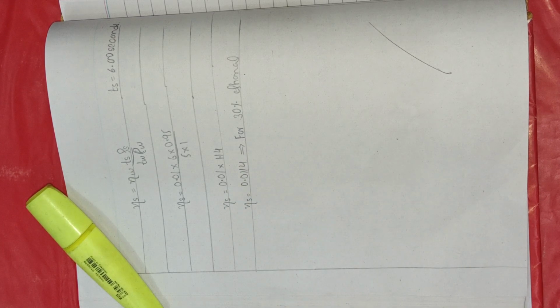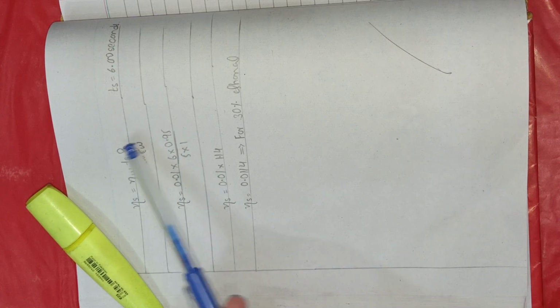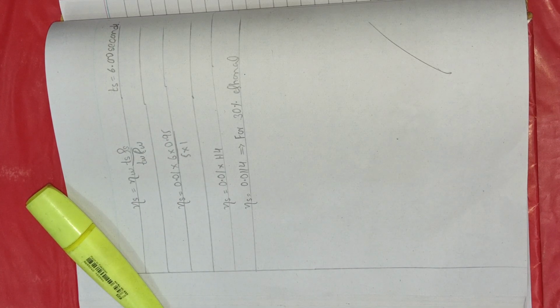Now you calculate the viscosity for the 20%, for 60%, for 80%, but whatever it is, you can calculate this viscosity by this formula. Put all the values in that formula, multiply and divide them, and you will get your final answer.